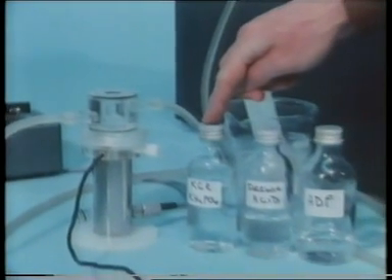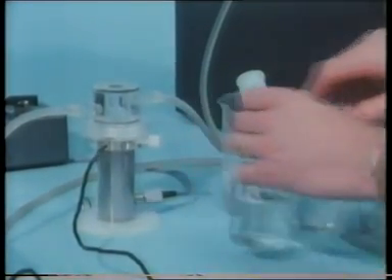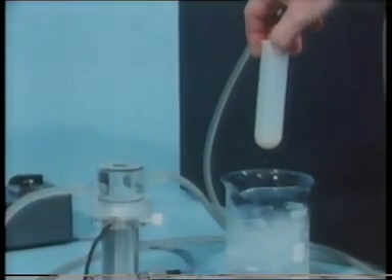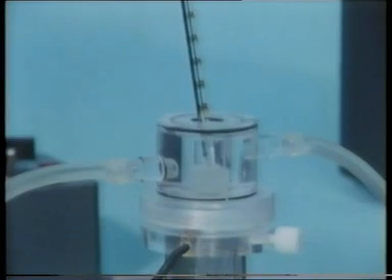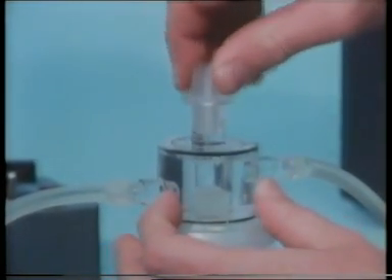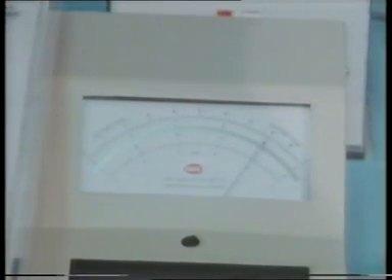In the reaction vessel, we put solutions of potassium chloride and potassium dihydrogen phosphate, succinic acid to serve as a substrate, and adenosine diphosphate, ADP. To this mixture, we're going to add some of our suspension of mitochondria. A measured volume of the suspension is added, and the stopper is inserted to exclude air from above the reaction mixture. We start the stop clock so that we can get an idea how long the process takes, and we can see immediately that oxygen in the solution is consumed by reactions in the mitochondria — a metabolic process.